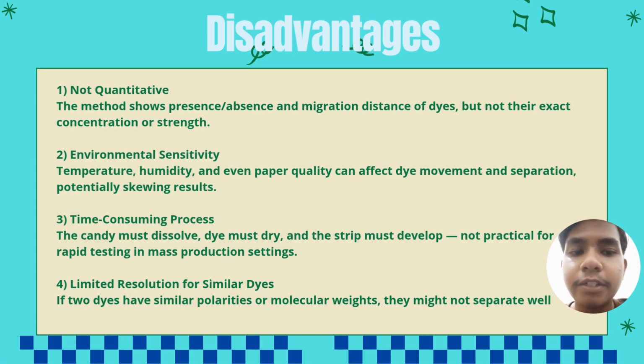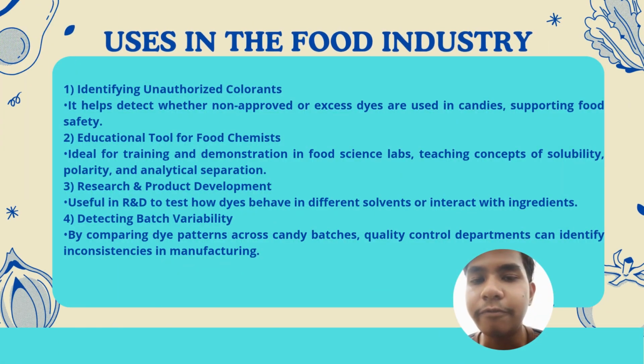Fourth, limited resolution for similar dyes. If two dyes have similar polarities or molecular weight, they might not separate well. Use in the food industry. First, identifying unauthorized colorants. It helps detect whether non-approved or excess dyes are used in candies, supporting food safety.